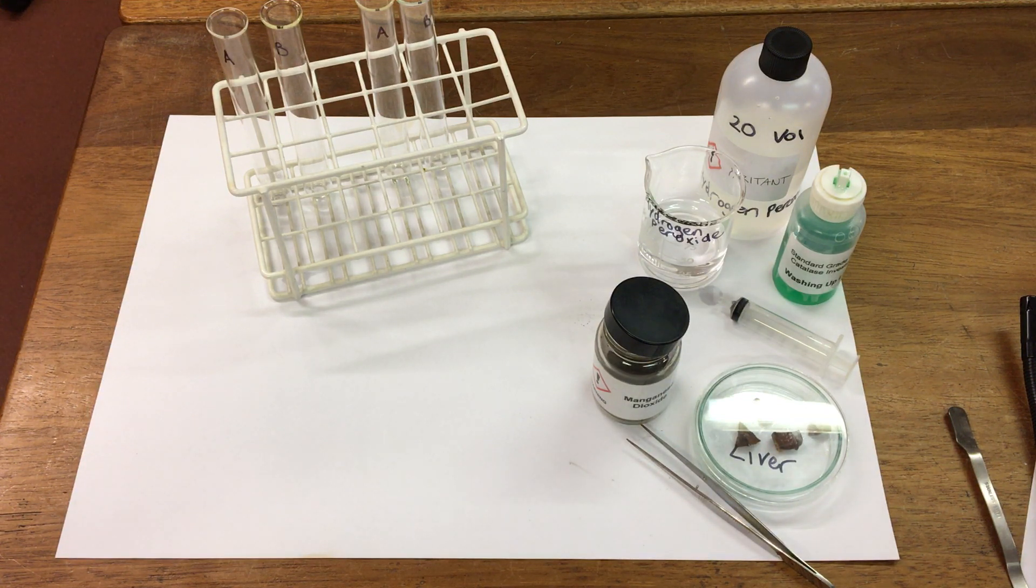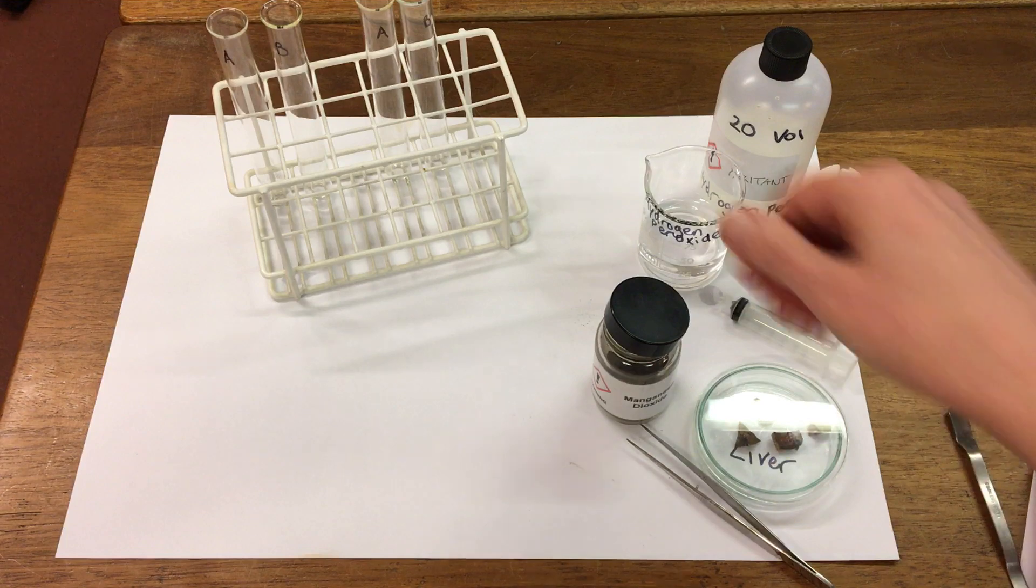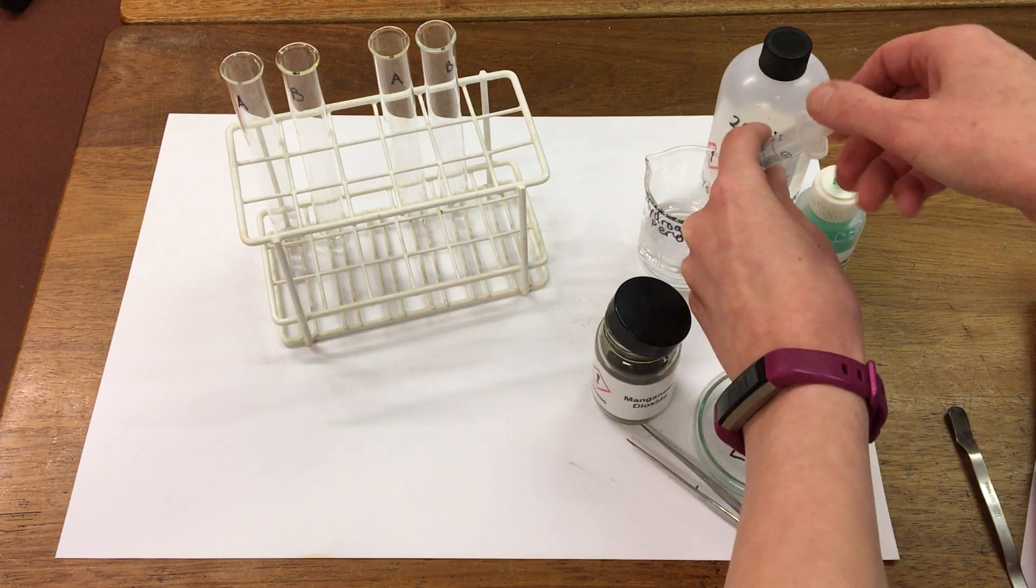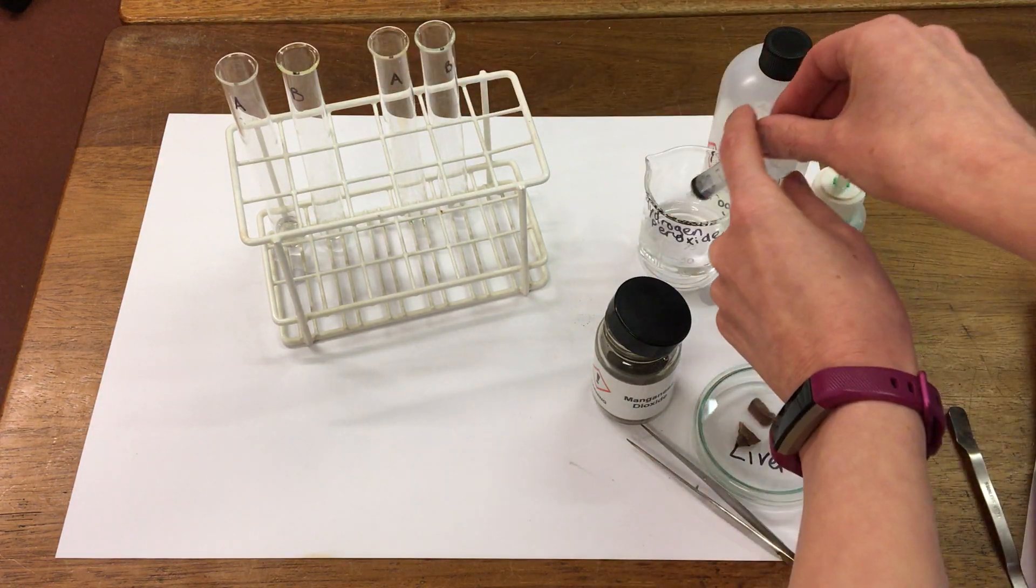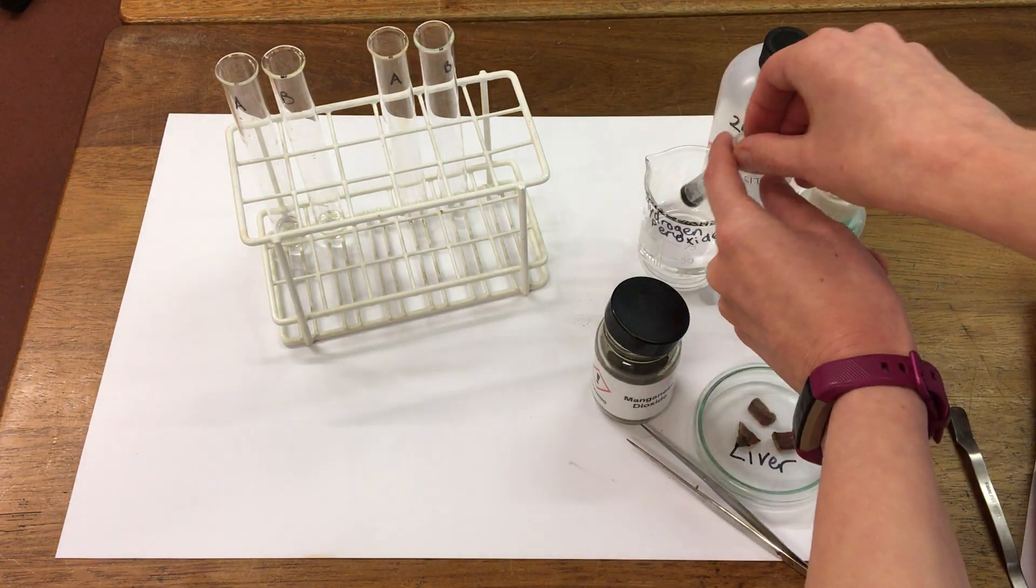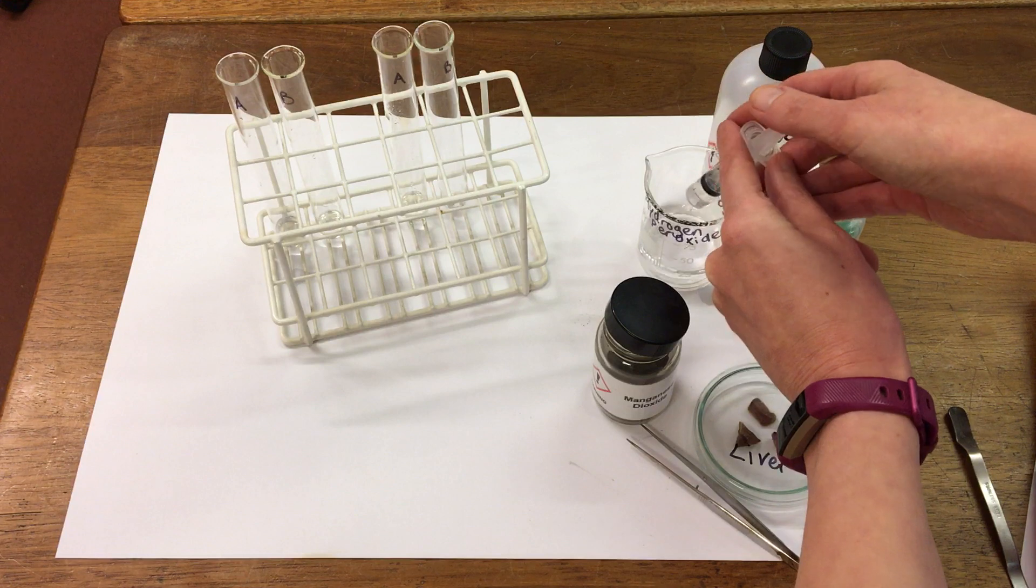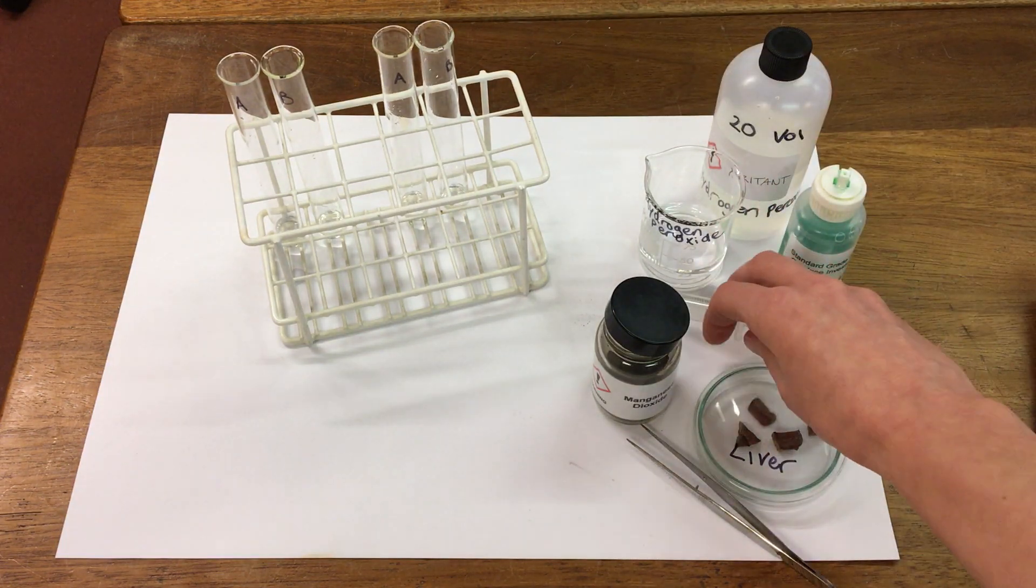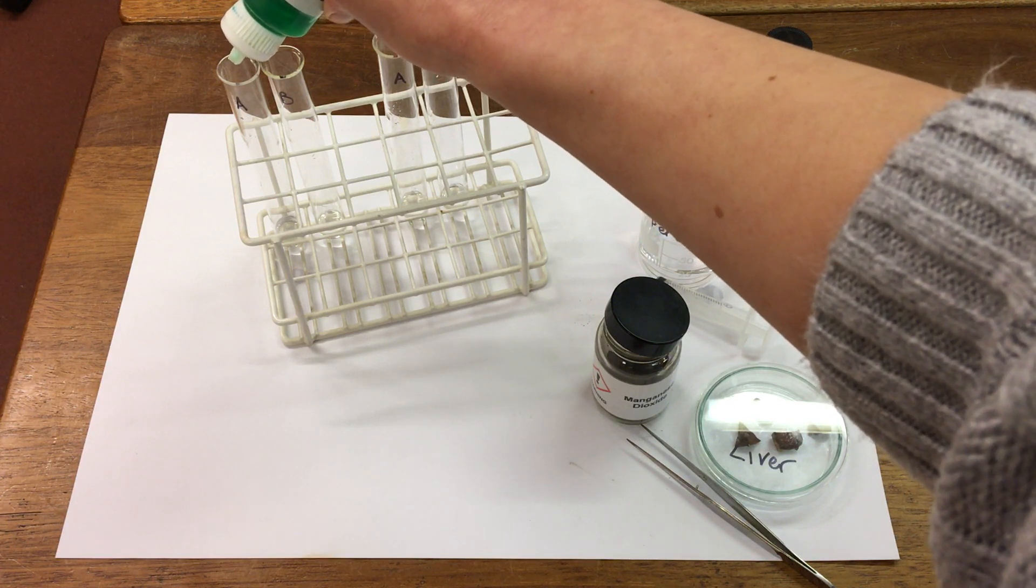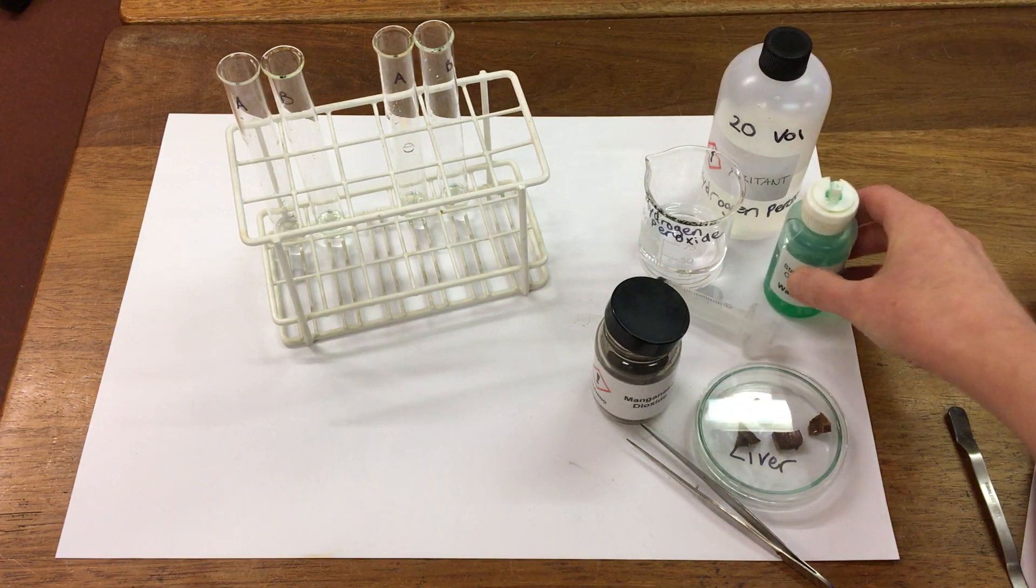If we want to measure the amount of gas being produced we can add detergent and this makes any gas that's produced show up as a foam. So we'll start again and we're going to add two mils of hydrogen peroxide to each of our test tubes. And then we're going to add two drops of detergent. And we'll gently mix the test tubes.